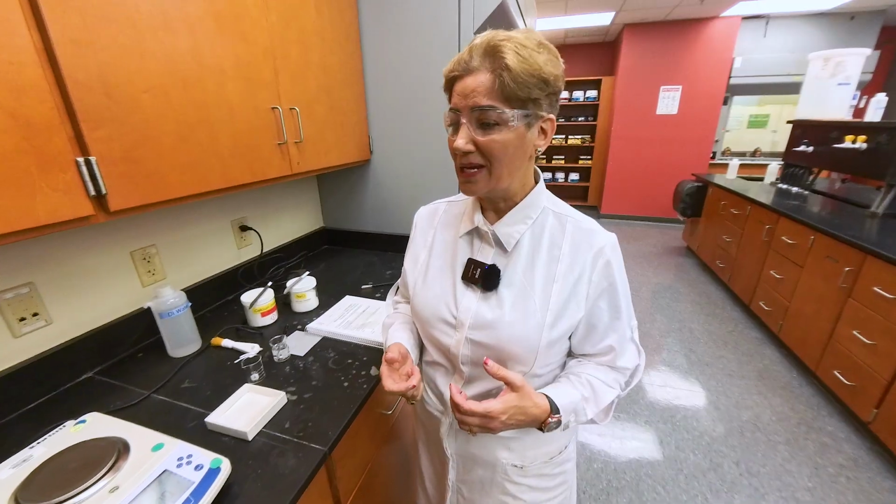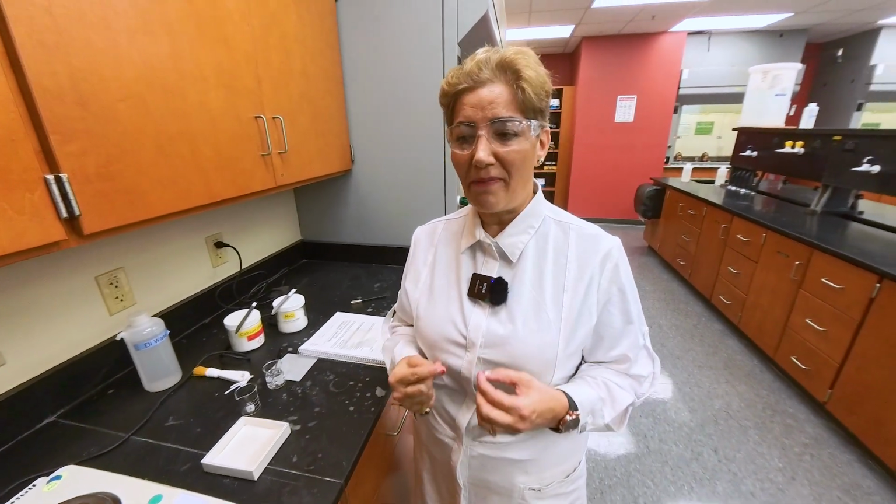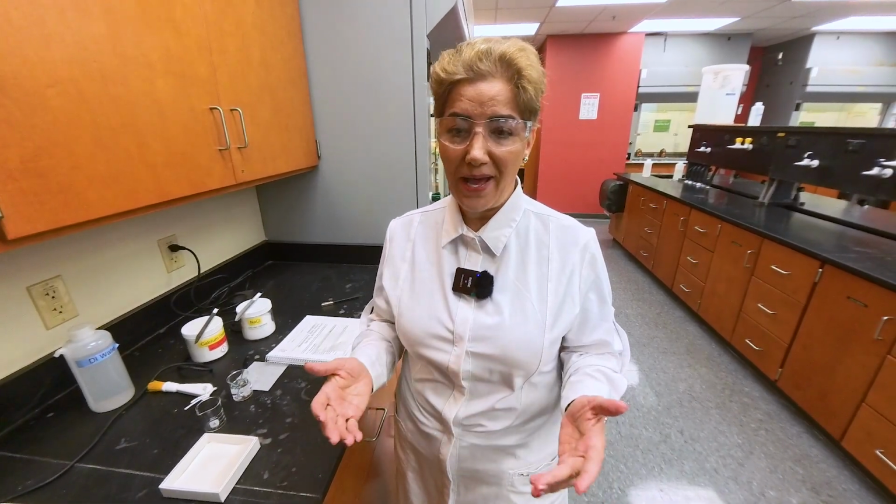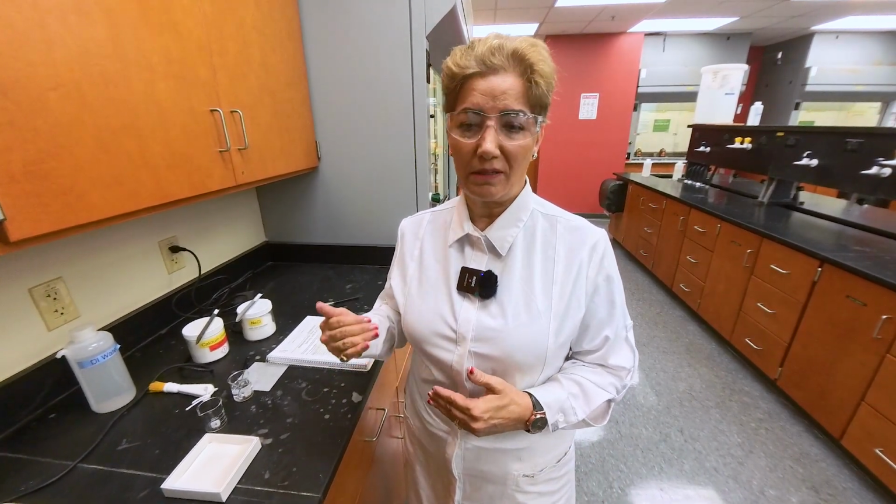For measuring mass, we have 3 different types of measurement: measuring out, direct measurement, or measuring by difference. And unless you read the lab manual, you're not going to get the difference, and you'll say, what is missing, the initial or the final mass? But you need to read the experiment from the lab manual.